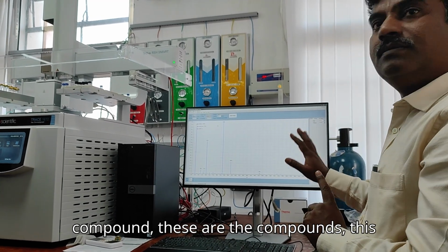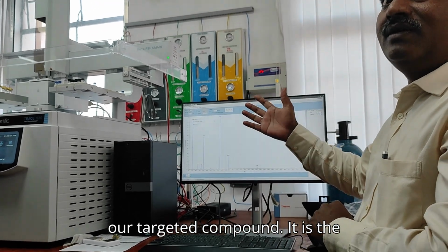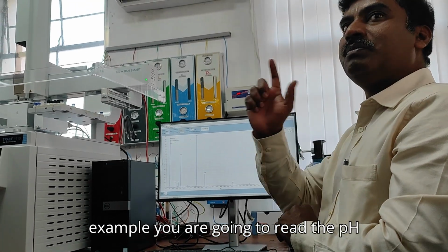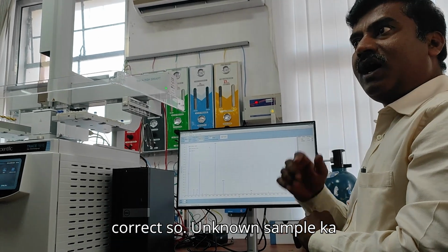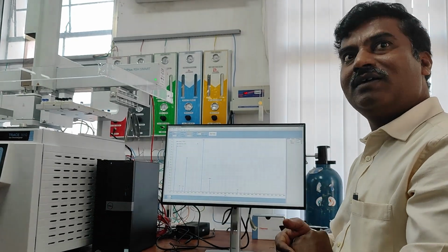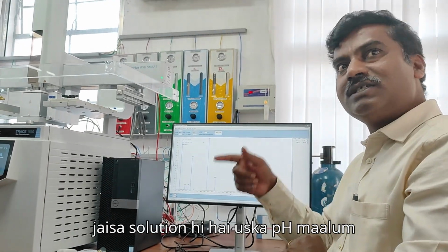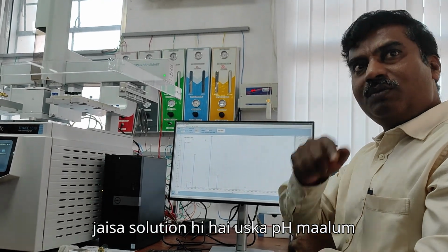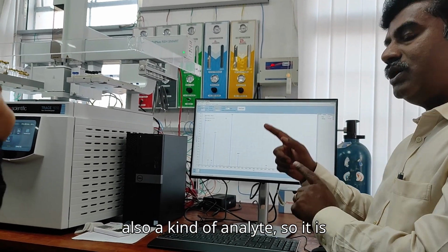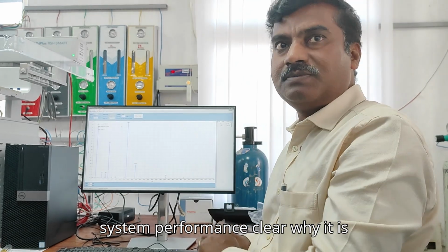Clear? These are the compounds. This is not our targeted compound. Generally, for the same example, you are going to read the pH, correct? Before measuring the pH of an unknown sample, you use a pH buffer, a solution whose pH is known, to set the meter. Similarly here, PFTBA is also a kind of analyte, preloaded in the system to check the system performance. Clear?